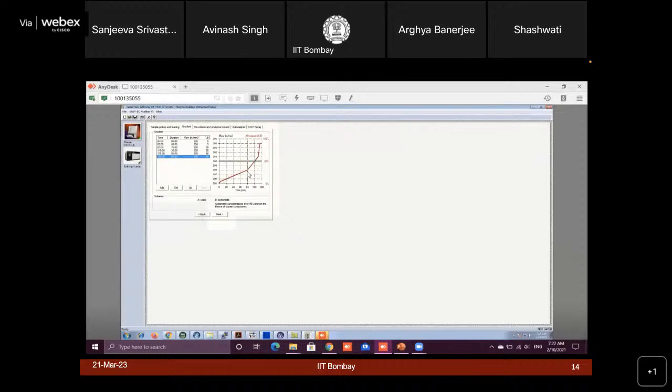We are generally increasing the hydrophobicity, and those which are more hydrophobic will be eluted at the latter stage. So here we are using a 120 minutes gradient, means 2 hours gradient, where my solvent B or my hydrophobic solvent is increased from 5% to 90%. So whatever my peptides will be coming will all be eluted. Once the gradient has been set, you will go to the pre-column and analytical column.